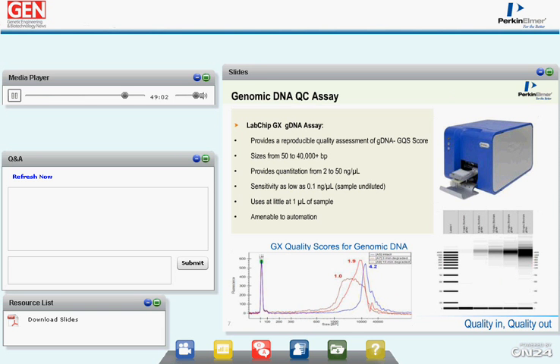The Genomic Quality Score, GQS, was developed to create a simple and easy metric to assess DNA degradation. The algorithm behind this metric analyzes the electropherogram and provides a measure of the intactness of the samples. This provides valuable information regarding the suitability of samples for downstream processing, eliminating costly rework, as well as understanding potential causes for poor data quality.